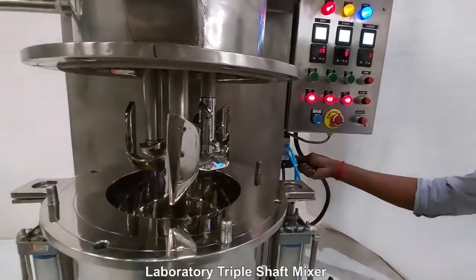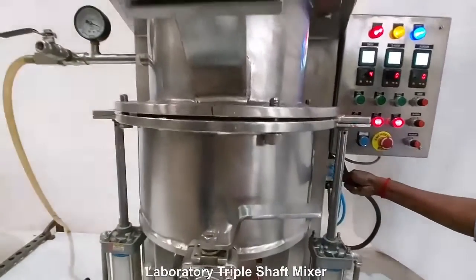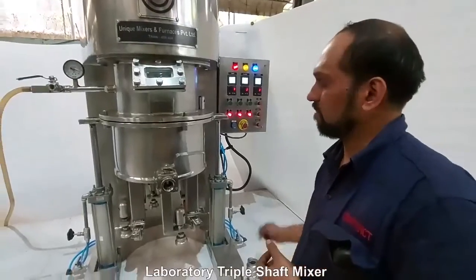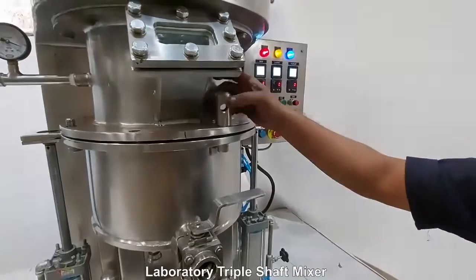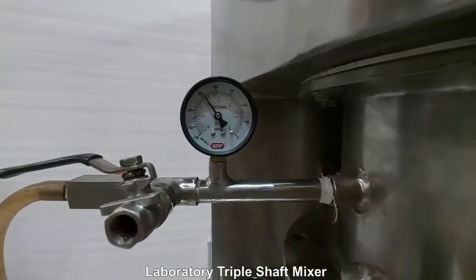The best part about this mixer is that this is a change can design. The lifting and lowering of the bowl is through a pneumatic operation, though a hydraulic design can also be offered. High levels of vacuum can be achieved.